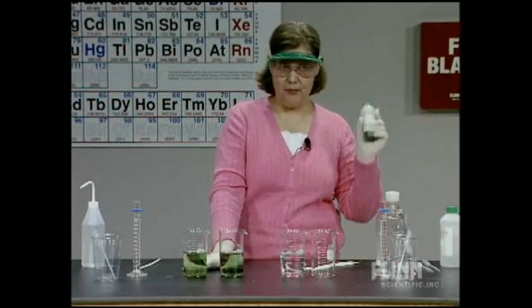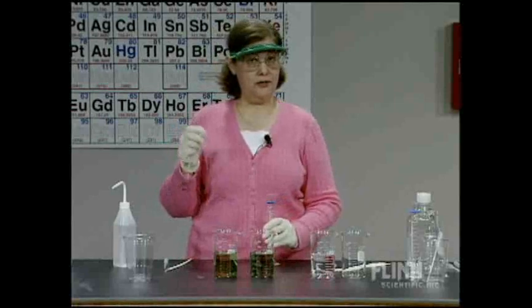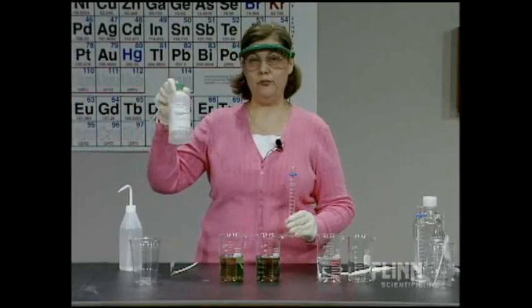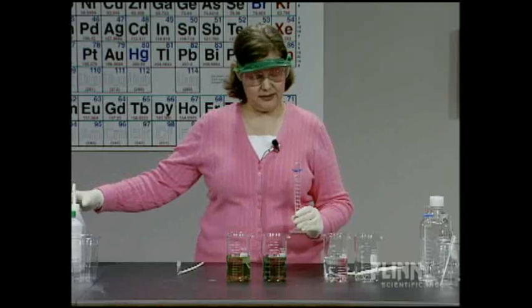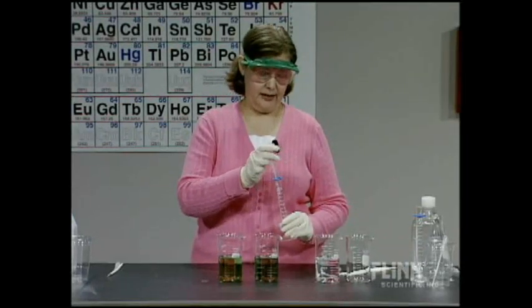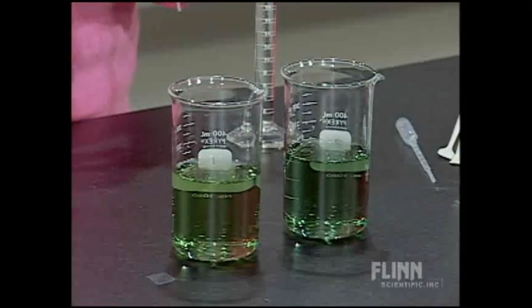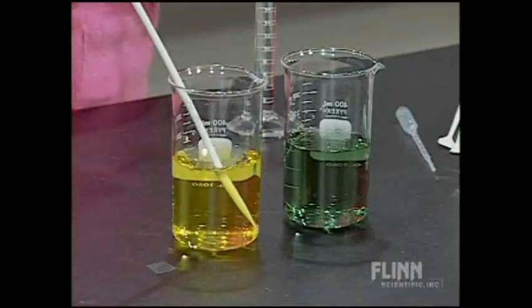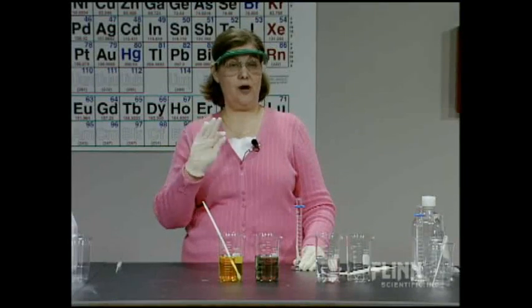We have two solutions that, based on the indicator, are at almost exactly the same pH. I have 1 molar hydrochloric acid in my graduated cylinder. The indicator is yellow in acid, blue in base, and green when neutral. I'm going to add one drop of 1 molar HCl to the distilled water. One drop of acid causes an immediate color change to yellow — the pH has dropped right away with just one drop of HCl.